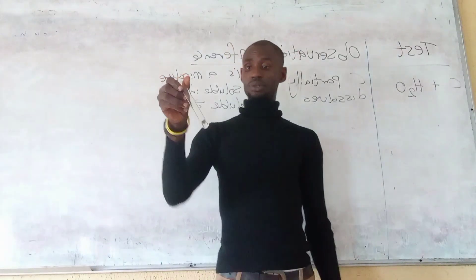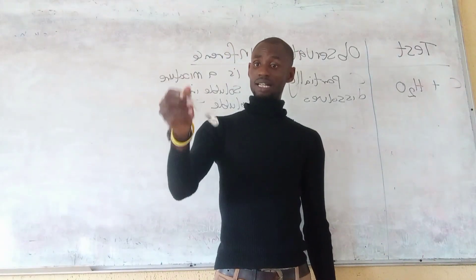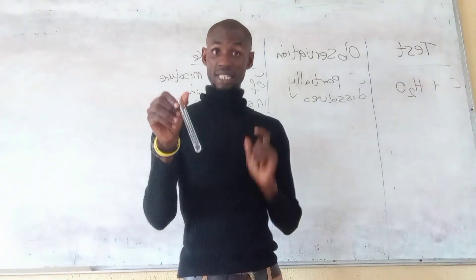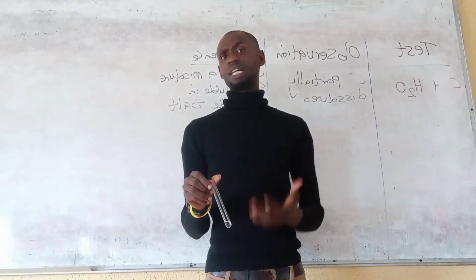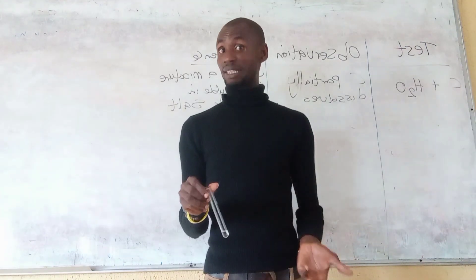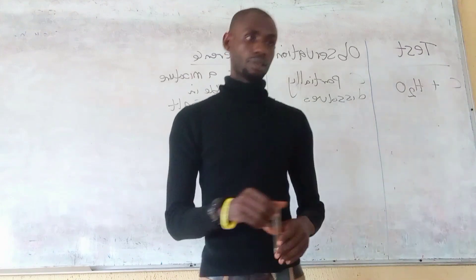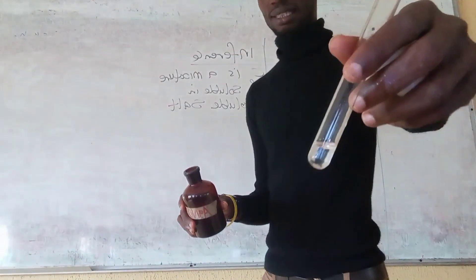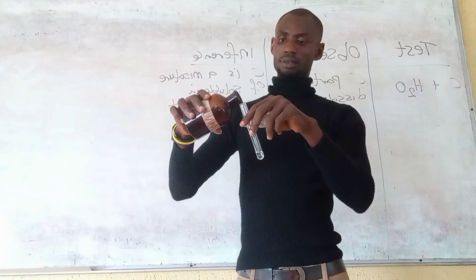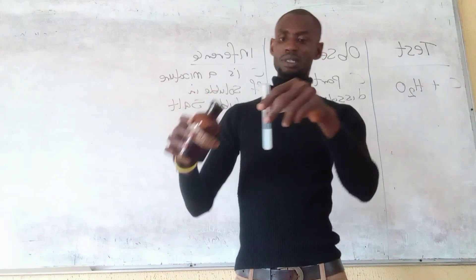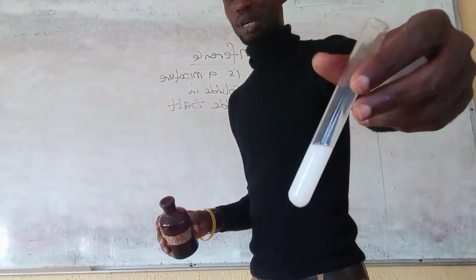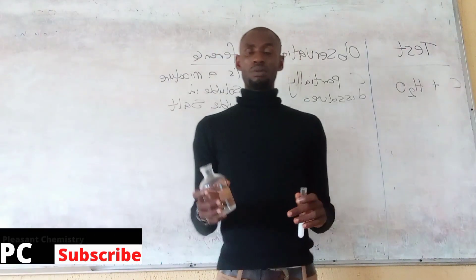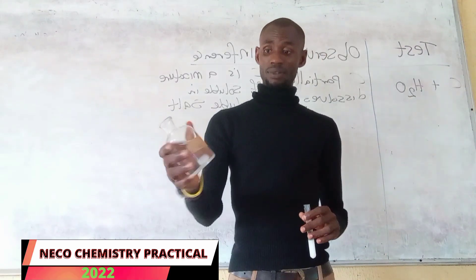Now for the filtrate — this is my filtrate. When carrying out the test on the filtrate, I want to add silver nitrate. Remember, when you add silver nitrate, you are testing for the chloride ion. If you look at the solution, it is colorless. When I add silver nitrate, we get a white precipitate, followed by the addition of dilute nitric acid (HNO3).